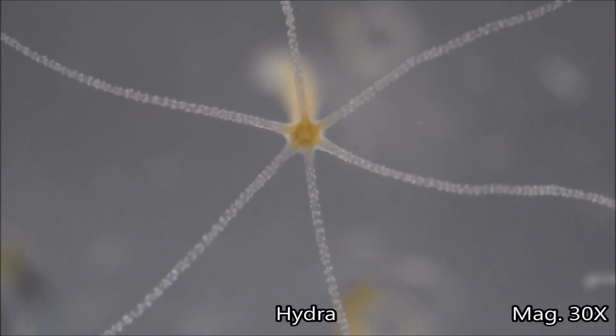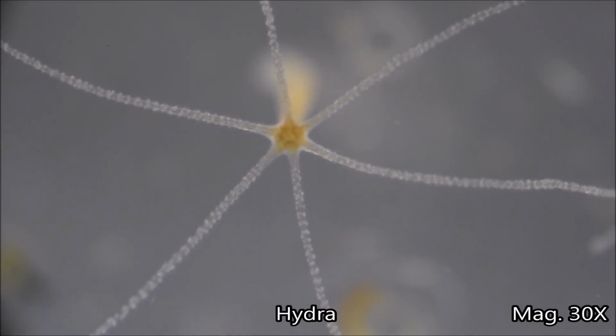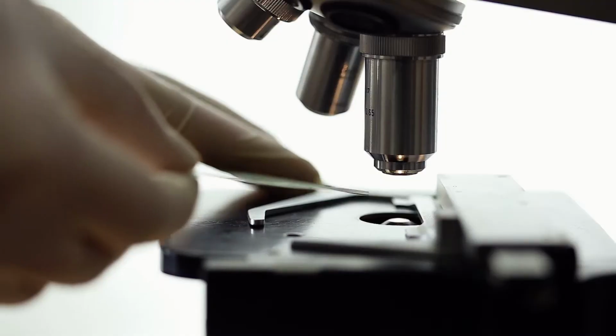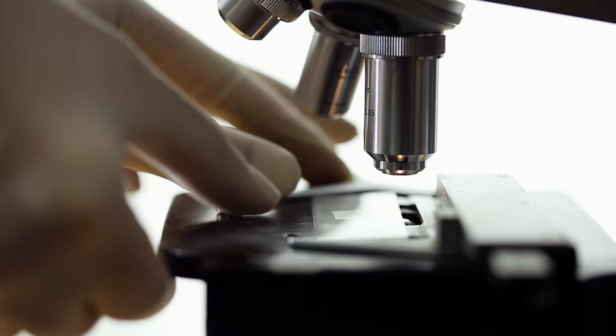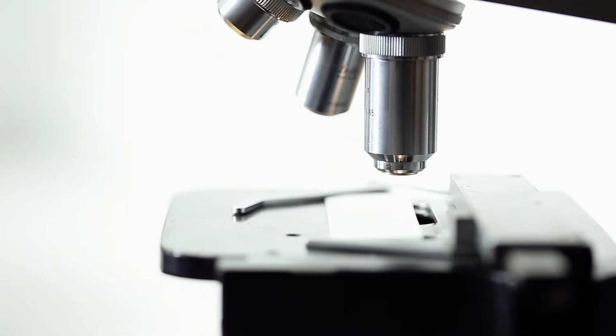This allows scientists to seamlessly transition from a wide view of the specimen's landscape to a close-up exploration of its tiniest features. Yet, the microscope's mastery doesn't stop at magnification alone. Illumination plays a pivotal role in revealing the hidden wonders of the microcosm.